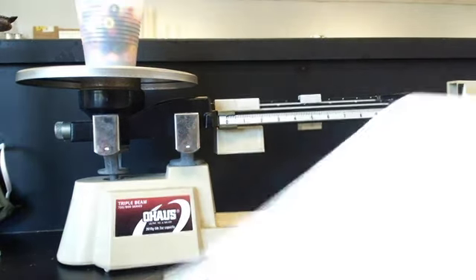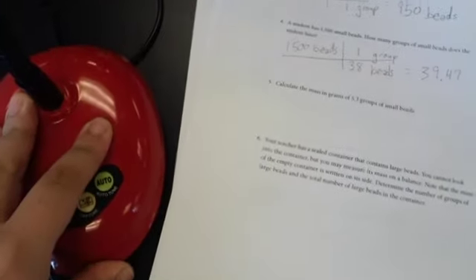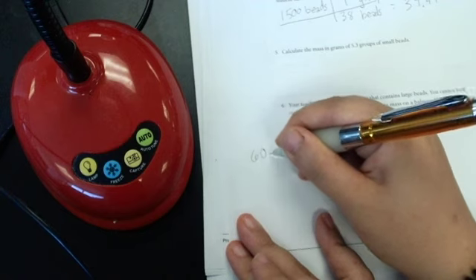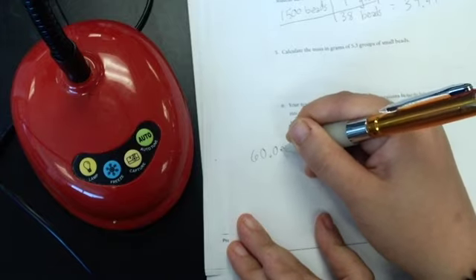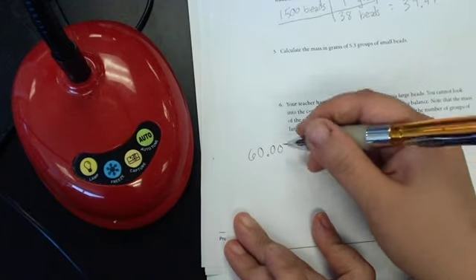Okay. So under here, 60 grams. Actually, it should be 60.00 because I know the 0 and the 0.0 after that for sure. So this is my estimate.